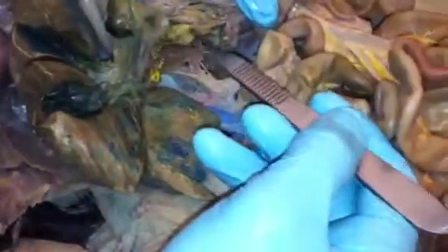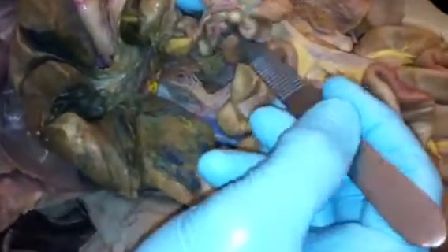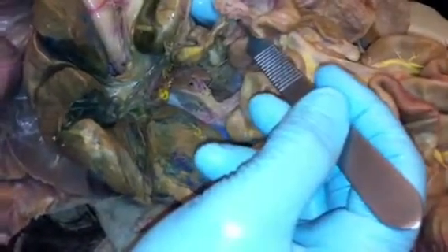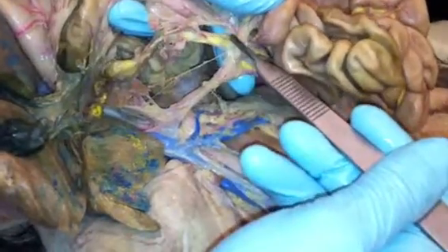This is the hepatic portal, which attaches into the superior mesenteric vein, and somewhere along here it goes into the gastrosplenic veins. And then we look for the adrenal gland.